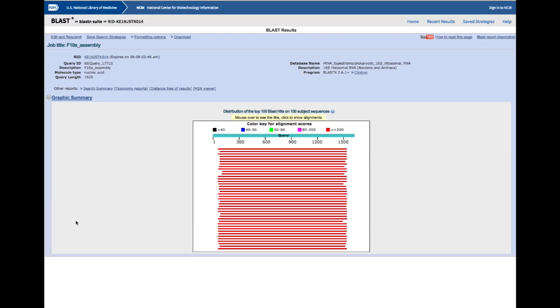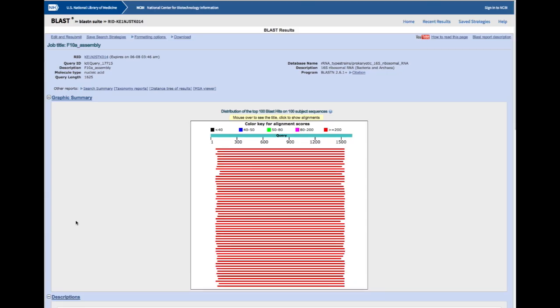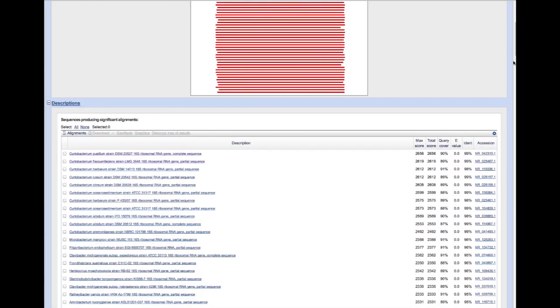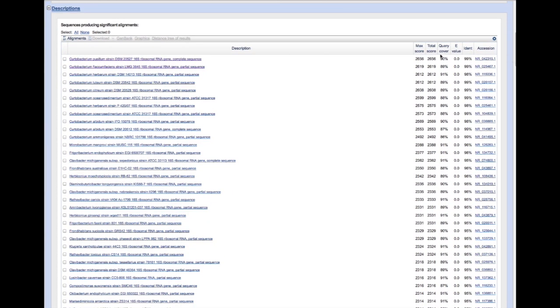Now we're ready to press the BLAST button and the program will search through all the existing sequences on the NCBI server to find matches to our query sequence. Here are our results. At the top of the page is the title of our query and the version of BLAST that we used — we should record that too. The graphic shown here allows us to quickly see that we have a lot of high-scoring matches, and many of them cover most or all of the query sequence. We need to look at the summary table and alignments before we can come to any conclusions.